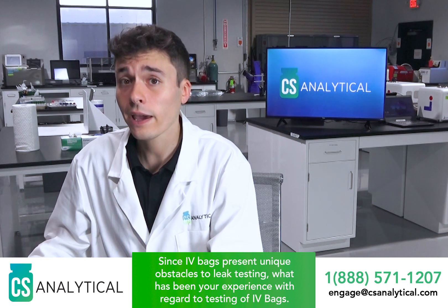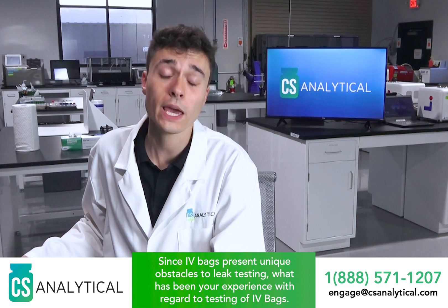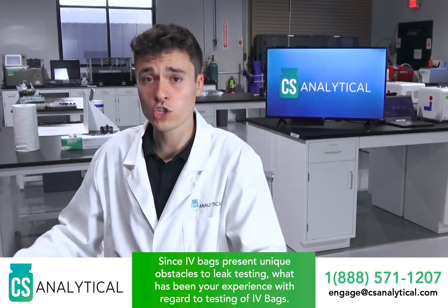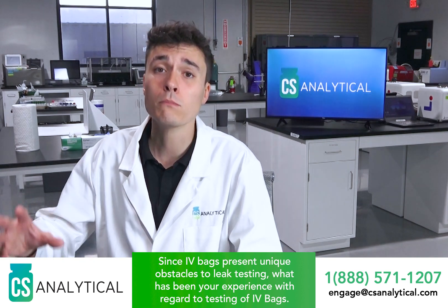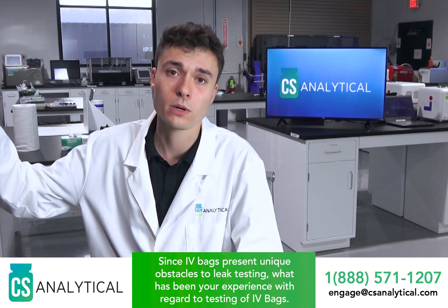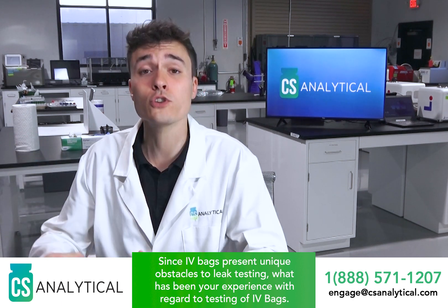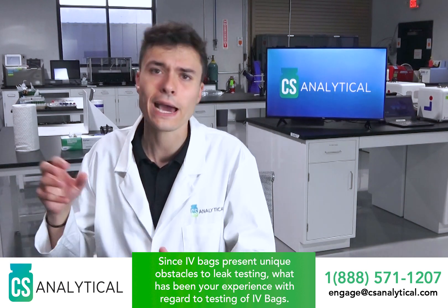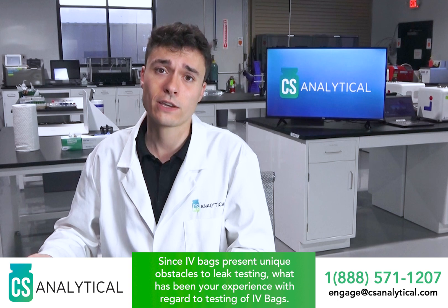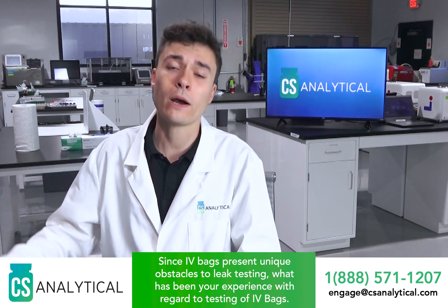When we think about vacuum decay, those three things have an impact on our ability to perform it as well. The larger the sample, the larger the chamber volume is, which means you need more leakage to raise the pressure inside that chamber in order to find that leakage. The plastic the bag is made out of contributes to outgassing — all the gas and moisture trapped in and on that plastic will come out under vacuum, and more surface area means more outgassing.